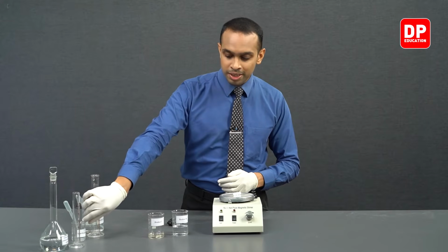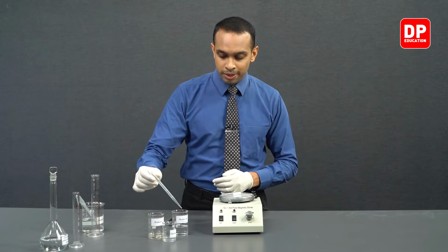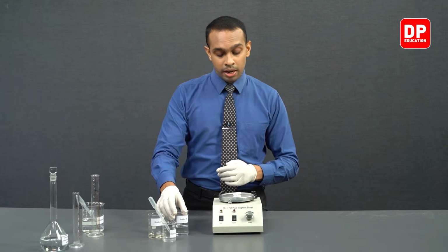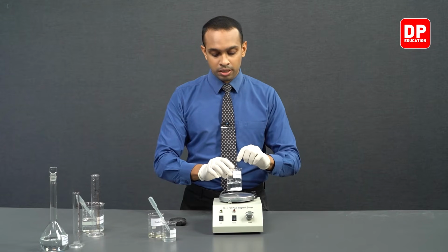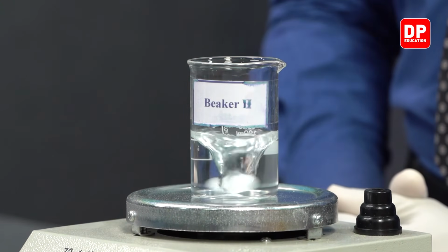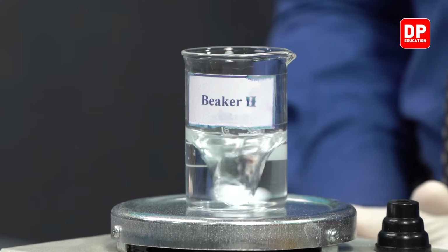Now students, we can add the starch solution here to beaker 2 as well. So we are going to add 5 drops of starch solution into our beaker 2, and like we did in the previous parts, we are going to add our magnetic stirrer bar into the beaker, and then we are going to turn on the magnetic stirrer, and all that is remaining for us to do now is to add Fe3 plus ion solution.